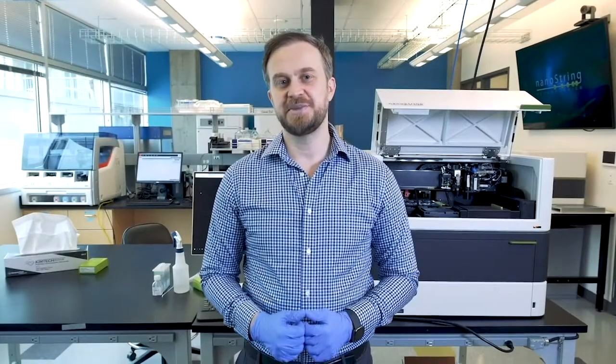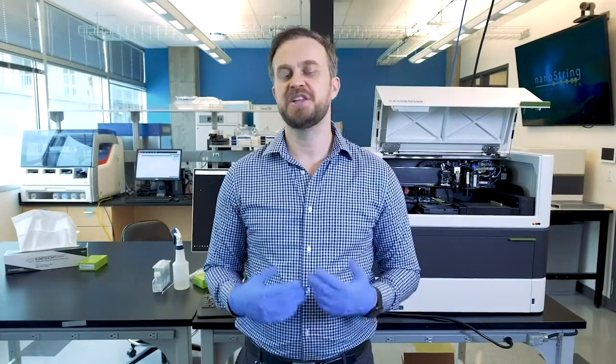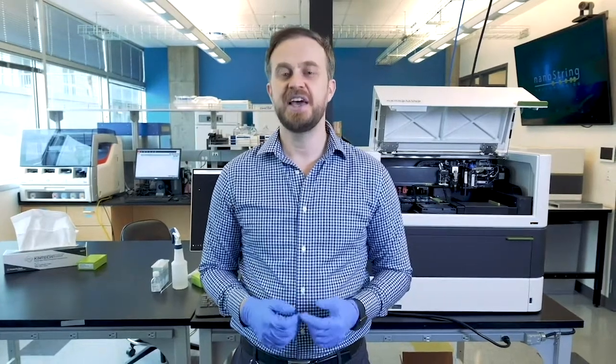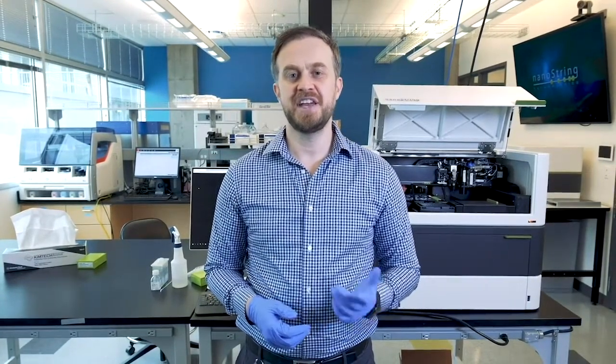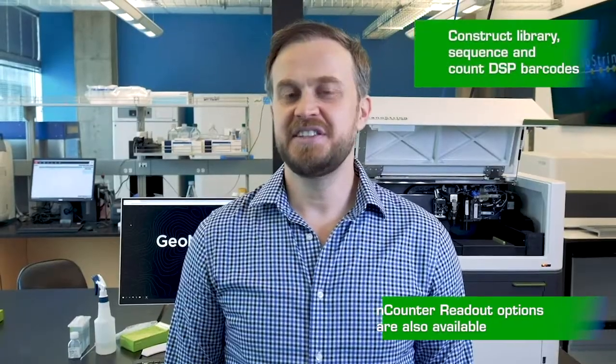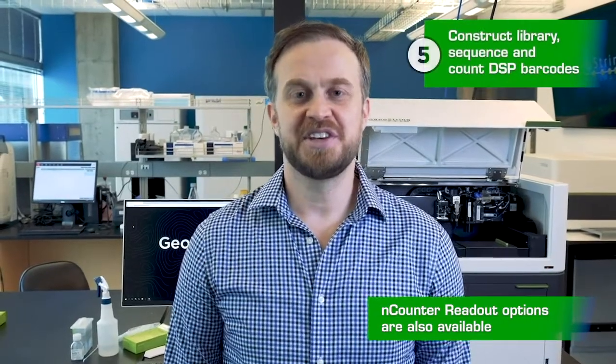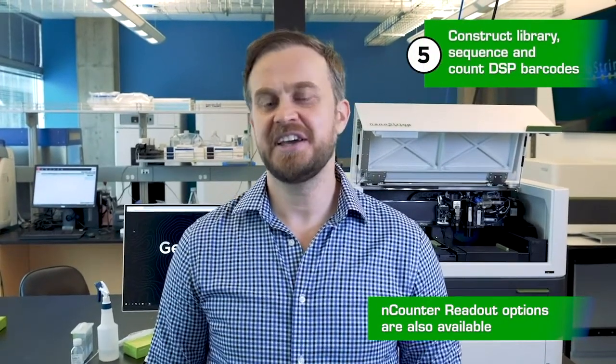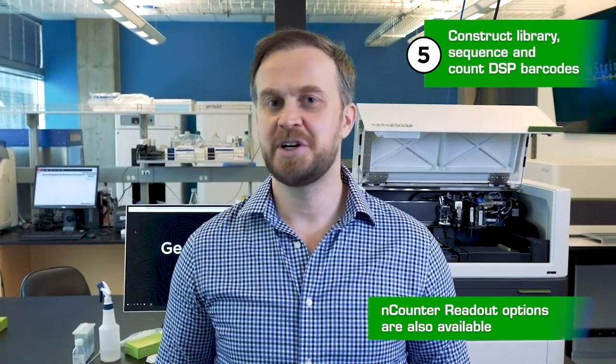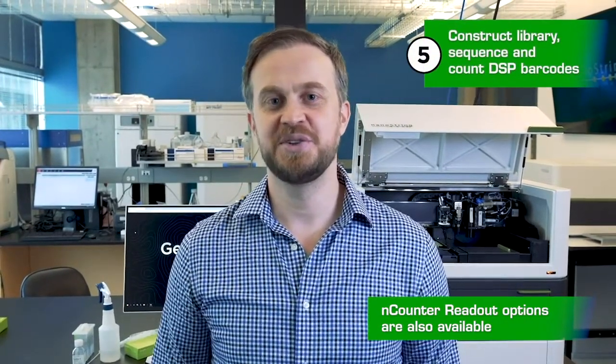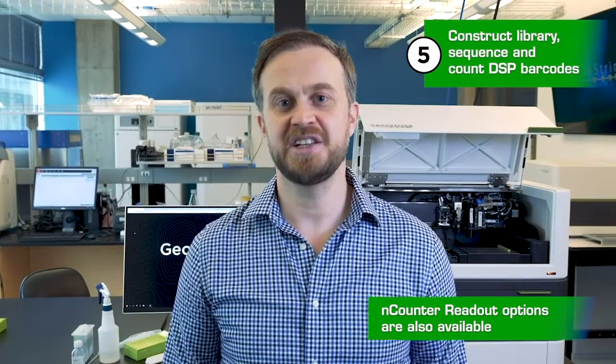Welcome back to the CX LAB experience. During this session, we will cover DSP collation plate preparation and analyzing spatially resolved RNA and protein data. The released DSP barcodes are prepared via a standard library preparation, so they can be read out on Illumina sequencers. The data can be mapped spatially back to the originating region of interest.